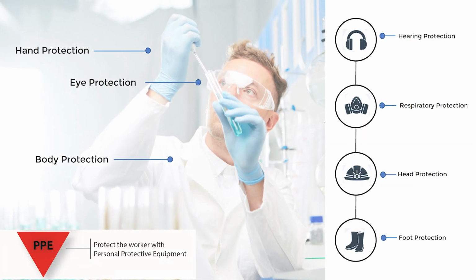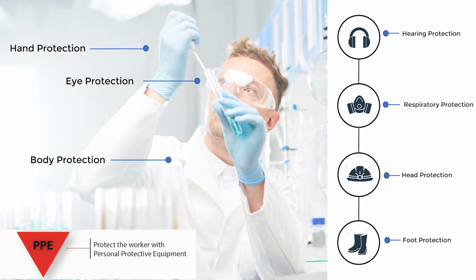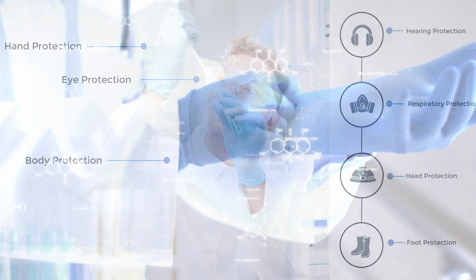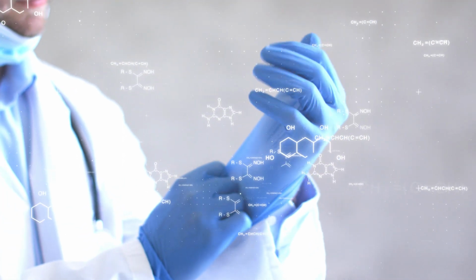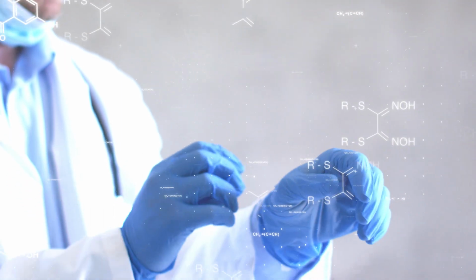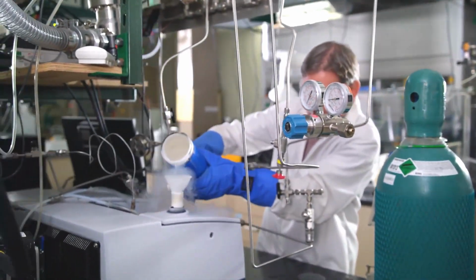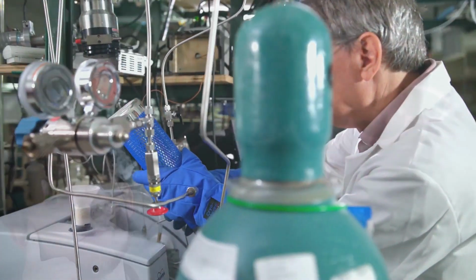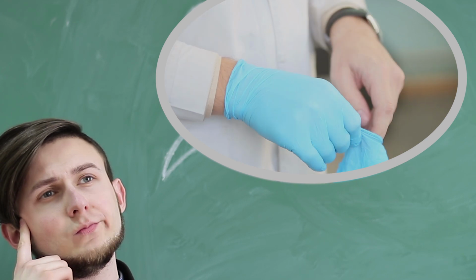equipment. Personal protective equipment, commonly known as PPE, is equipment worn to minimize exposure to a variety of hazards. Gloves are an example of PPE worn to protect skin from various exposures like chemicals, biological materials, excessive heat or cold, and lacerations. Appropriate glove selection is essential for carrying out tasks where most manipulations are done using hands. Are you confident that the glove you are wearing is appropriate for the work you are performing?